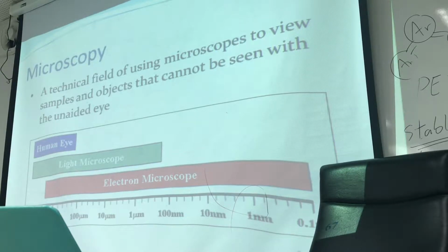And for the final one that we mentioned last time, it was the transmission electron microscope. Remember? The electron must transmit through the sample. So the sample must be very thin. We need to make the sample very thin. But what is good about the transmission electron microscope is it can have a magnification of 1,000,000, so that you can see the arrangement of the atoms. Okay, so this is what's happening.